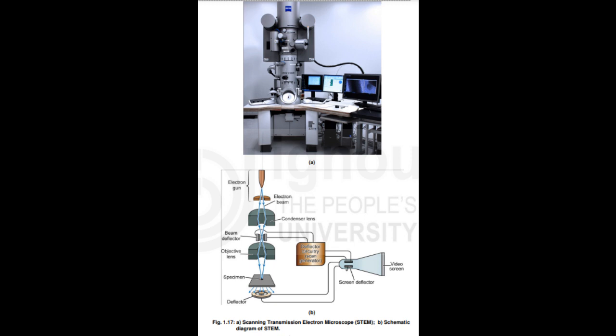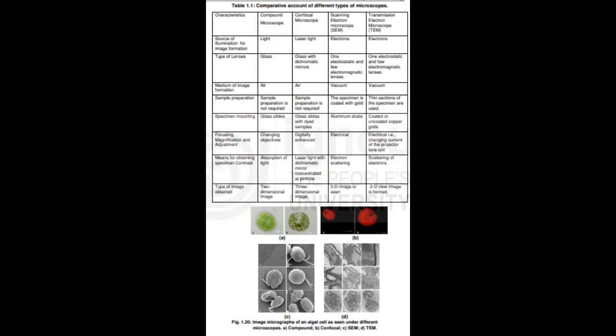1.18. Samples present even in low-pressure gaseous and high humidity, up to 100%, conditions can be observed clearly. The technique enables the imaging of biological samples unstable in high vacuum conditions of conventional electron microscopes. This is because this microscope possesses a secondary electron detector which is capable of operating in the presence of water vapor.